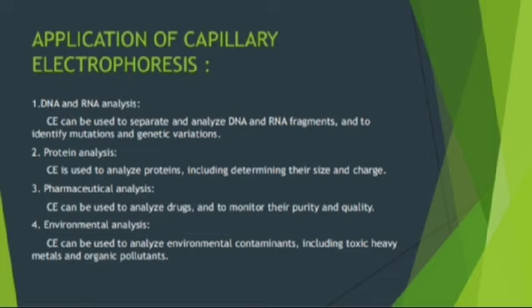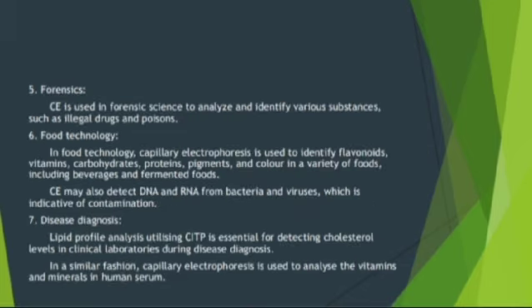In environmental analysis, capillary electrophoresis can be used to analyze environmental contaminants, including toxic heavy metals and organic pollutants. Forensics. Capillary electrophoresis is used in forensic science to analyze and identify various substances such as illegal drugs and poisons.